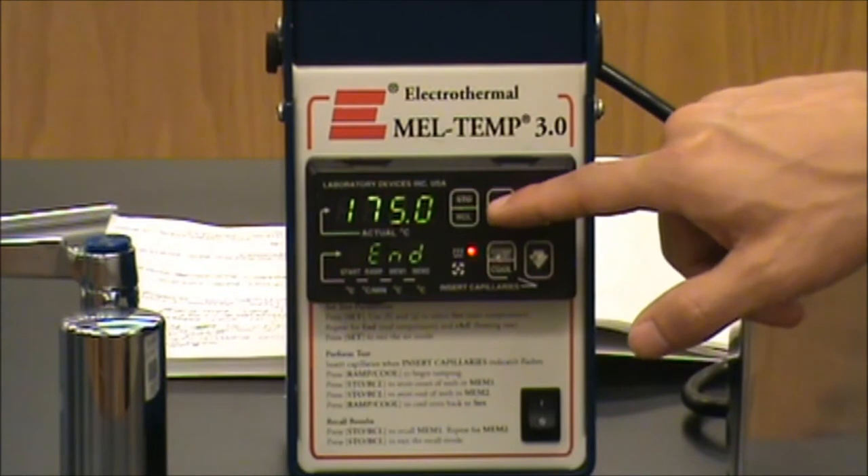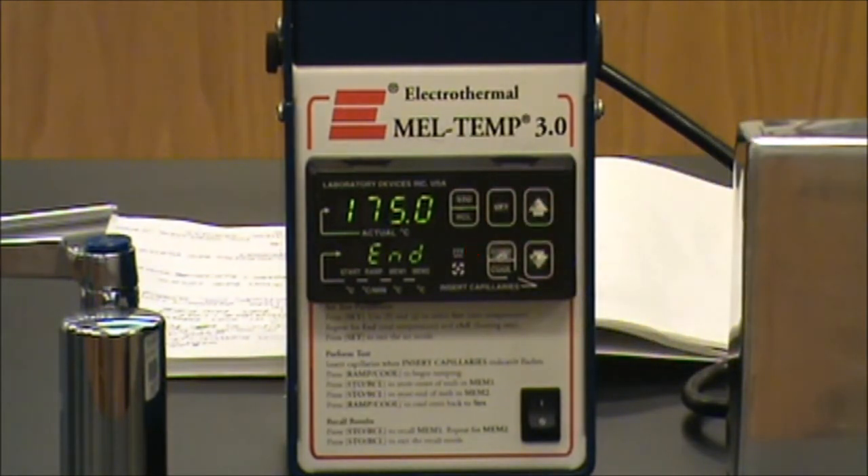If you hit the set button once again, it brings up an end temperature. I suggest an end temperature at least 10 degrees higher than the expected melting point of your compound.